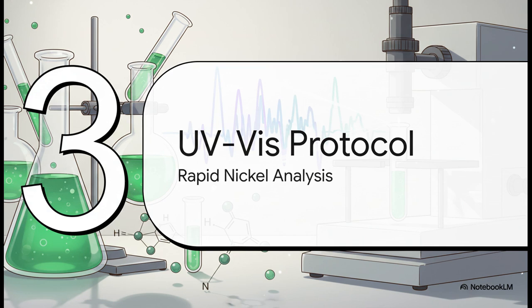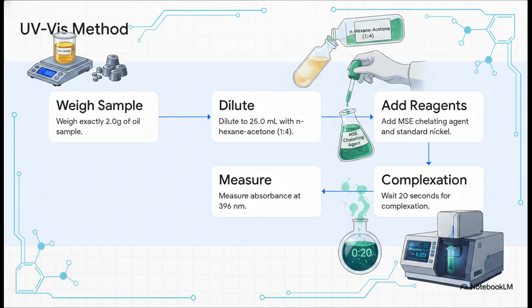Section 3. Protocol: UV-Vis Spectrophotometry. Let's walk through the rapid analysis. Let's see how this precise chemistry actually translates into a rapid, highly repeatable lab procedure.